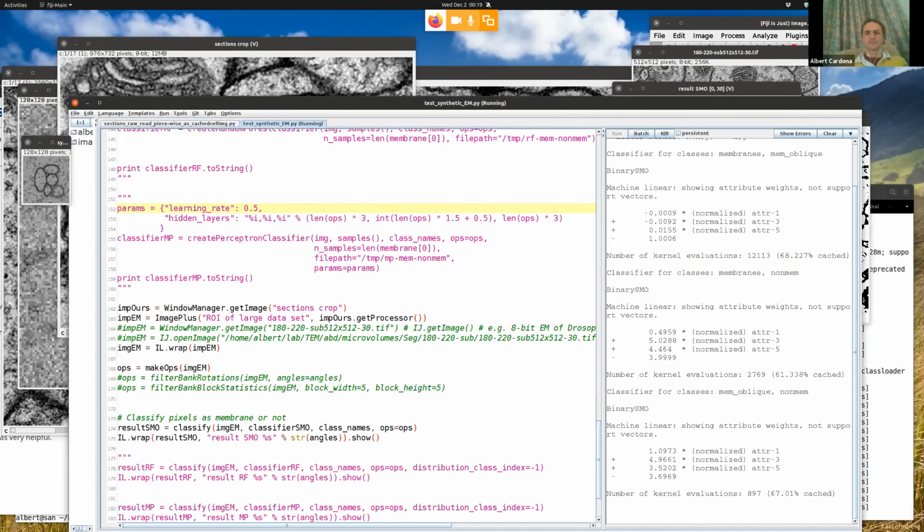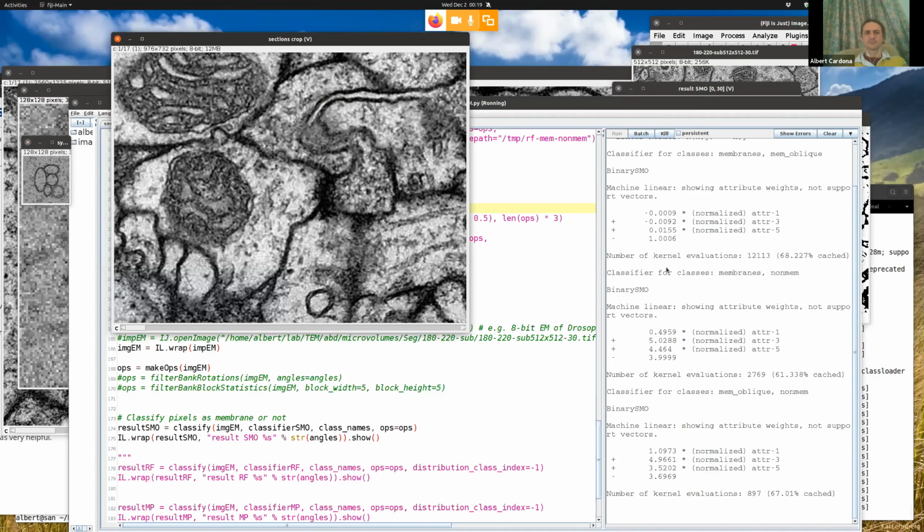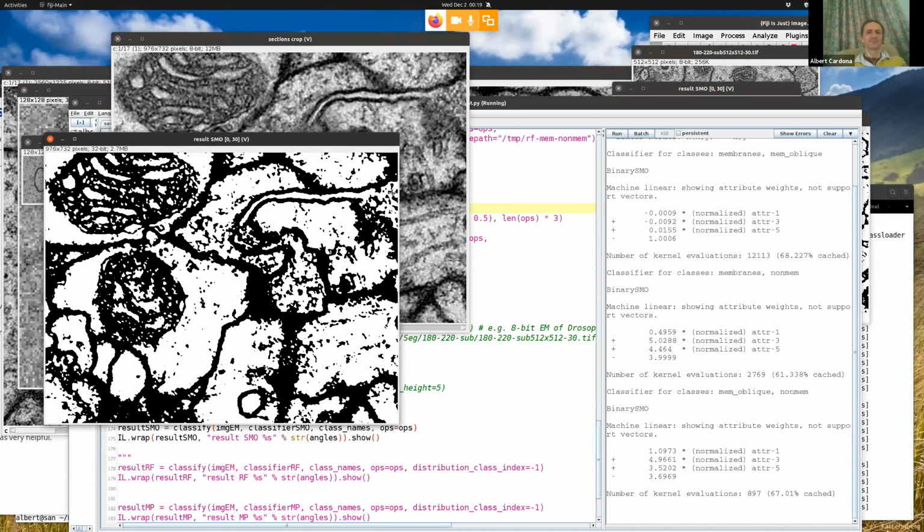Come on. That's taking a bit too long. Boo, come on, my poor laptop. I should have done this in the big server. There it is. All right.